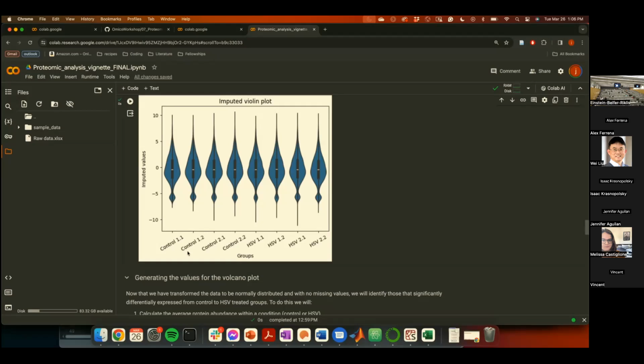Basically, regardless of where you put your threshold, that protein will be towards the bottom of the volcano plot, in the very low part. So whether that protein has valid values or you throw it out, in the end, it's not going to make much of a difference in your biological interpretation.